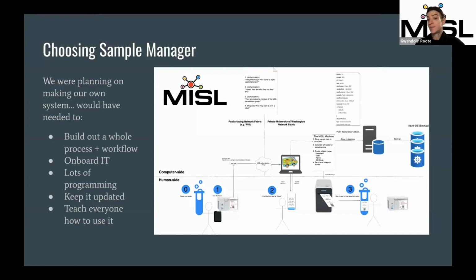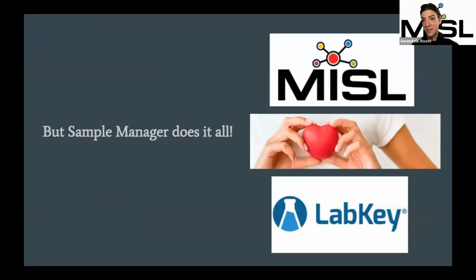And as I was getting onboarded, all I could think was that creating this would take up all of my time. I wouldn't be able to do any other managerial things. So I started looking around for some other ways that we might be able to achieve these same goals without having to make it ourselves. And thankfully, there is a great solution. Sample Manager does it all.